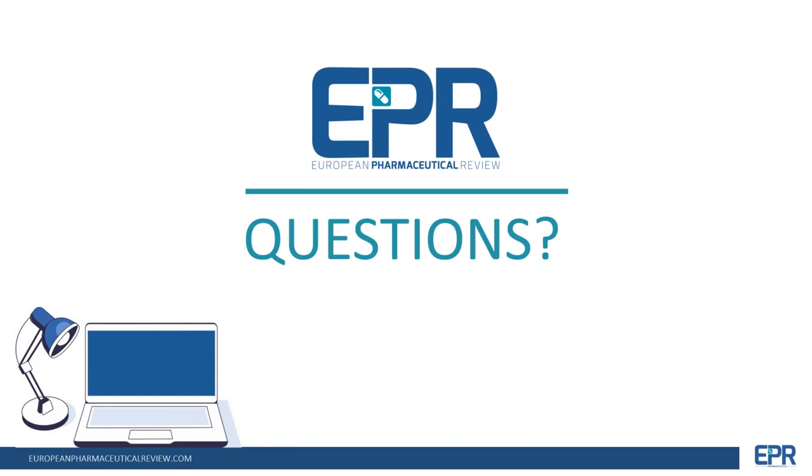Okay, good, thank you. Moving on to another question. Somebody asks, can you confirm if this was performed in positive mode LC-MS? Who can take that one? We haven't done that work ourselves, but our collaborators in the industry have, and they reported that they saw comparable results in positive and negative mode in terms of the sensitivity of the method and also the level of adduction.